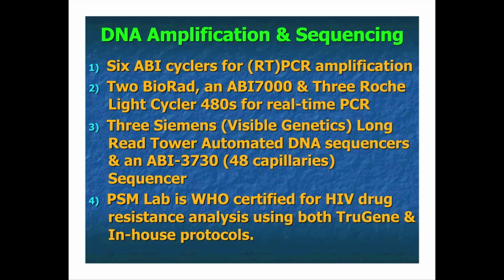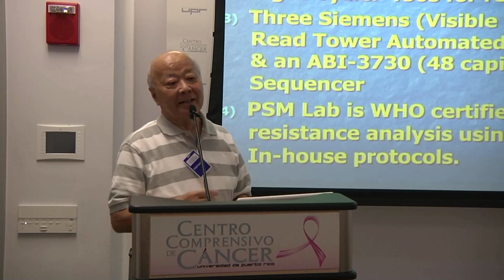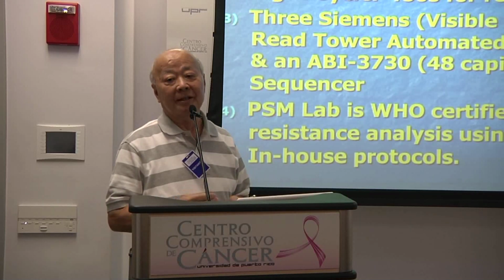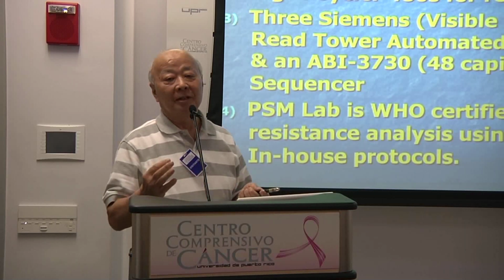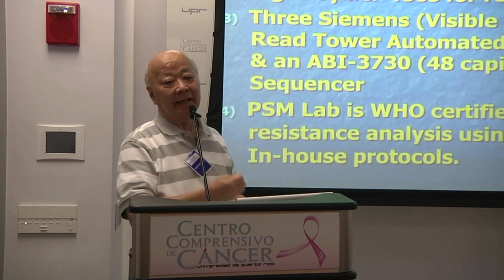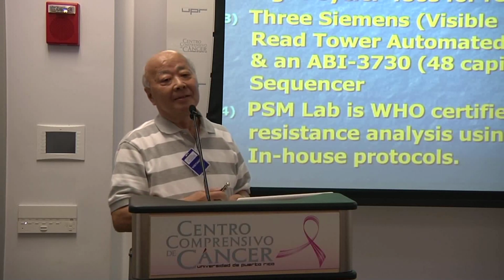And many of you do the DNA amplification sequencing in your own lab. But again, I want to emphasize even the sequencing now has become simply a tool. It's not a purpose. So it is a question of what you are going to do with the sequencing data you obtained, not really to obtain the DNA sequencing. So we can help.